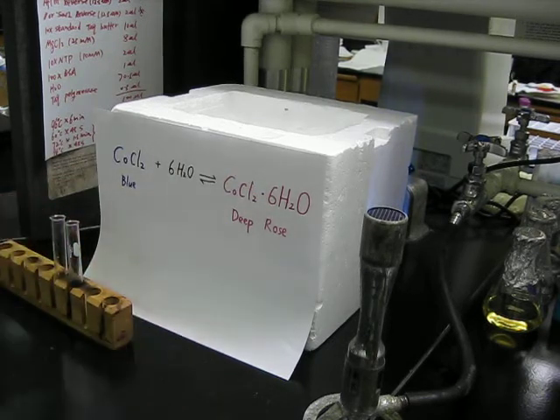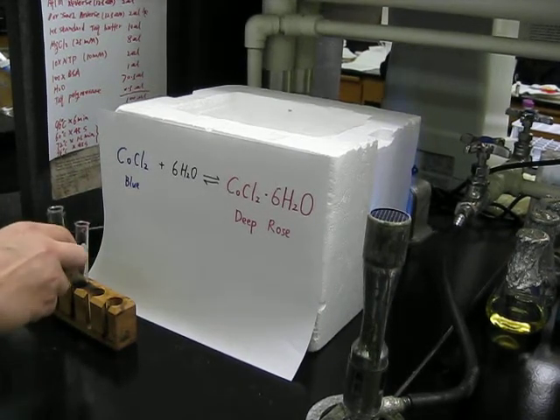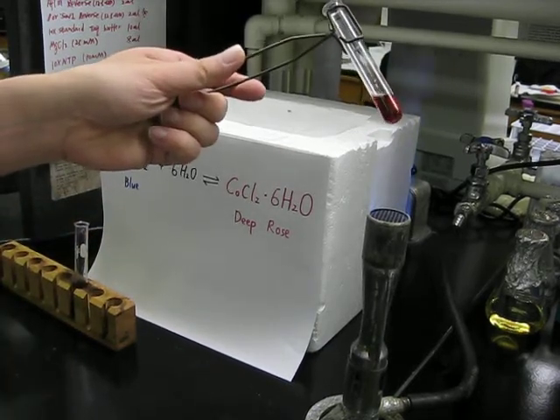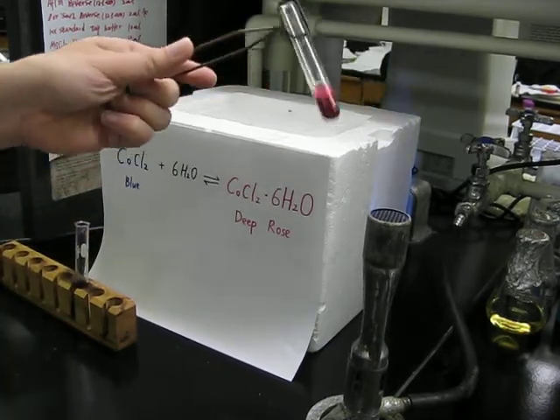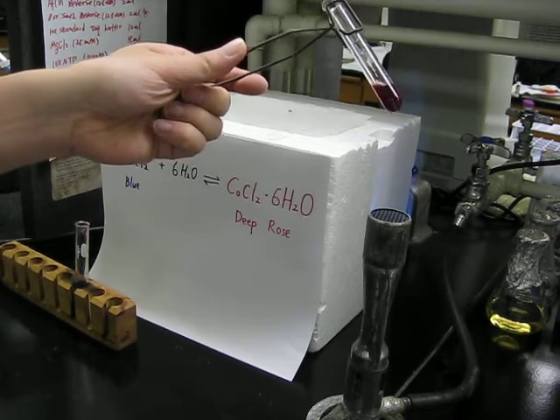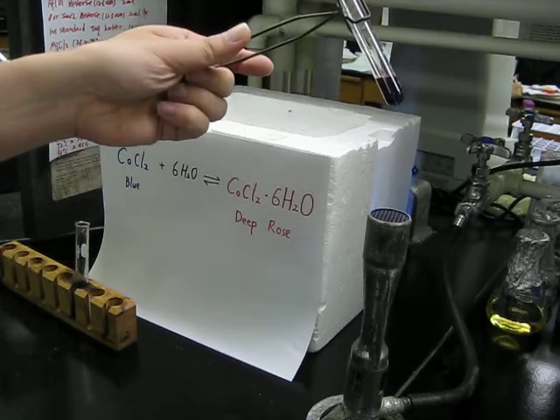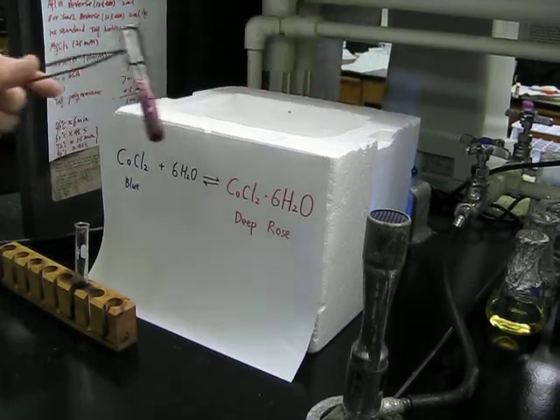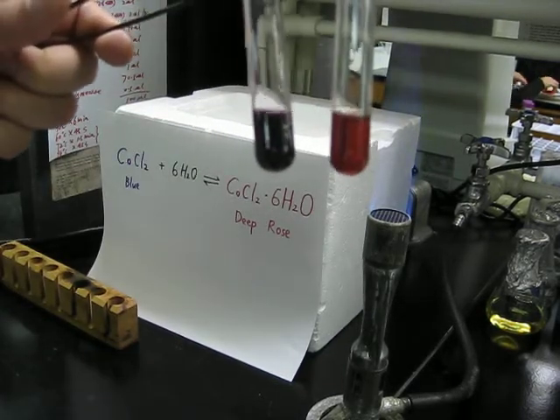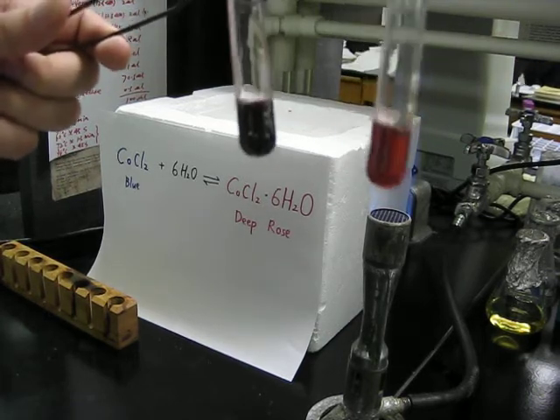Okay, so now the first step, I'm going to heat one of the liquid samples using the flame. Okay, so let's see, until it boils, and you will see the color will change. Right now, if I shake, have you noticed the color change? Okay, so now if I compare 2 of them, you see the left one, which is heated, has blue color. The right one is still red color.